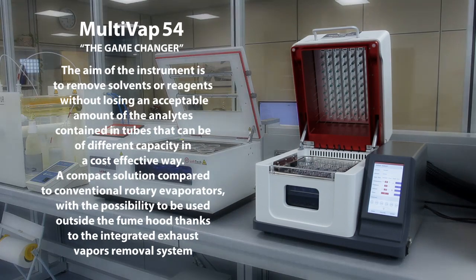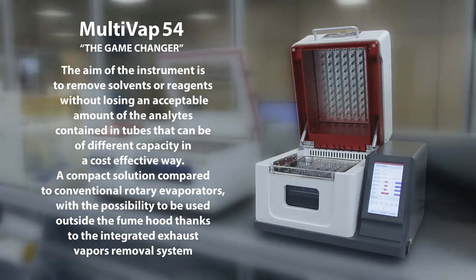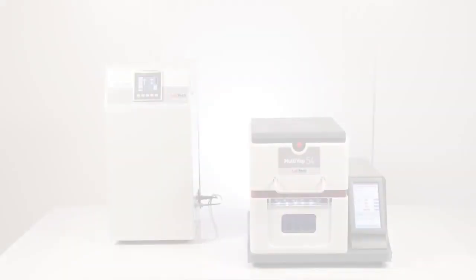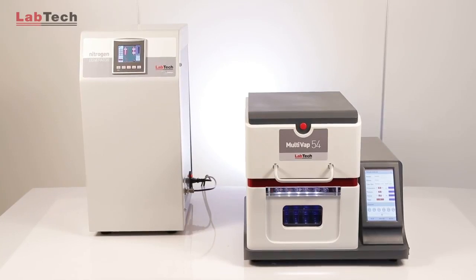A compact solution compared to conventional rotary evaporators, with the possibility to be used outside the fume hood thanks to the integrated exhaust vapors removal system.